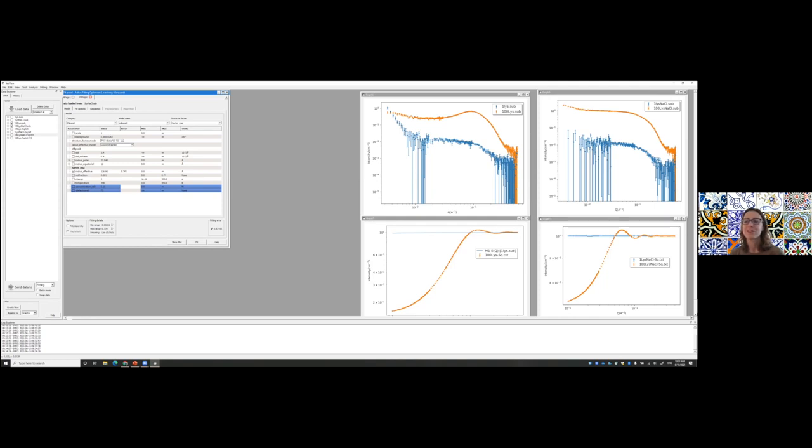It's a curse because it means you're going to have to do some simulations to relax the structure and to have a good starting model for your data. But on the other hand, it's a blessing because you have a starting structure, so you don't have to do this more crude approximation of, let's say, an ellipsoid, which is a very crude approximation. Obviously, we know there's a lot more detail in the structure than that. But you don't always want to see that. So maybe you already know what the structure is.